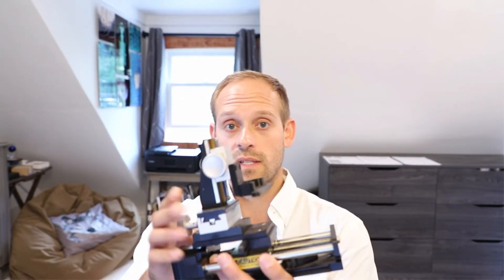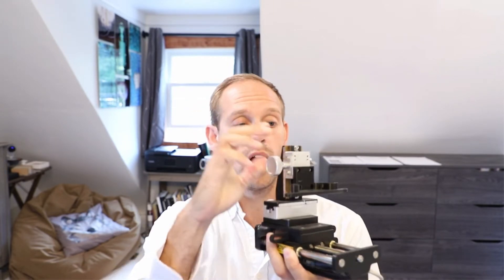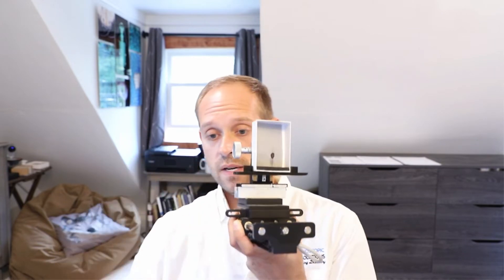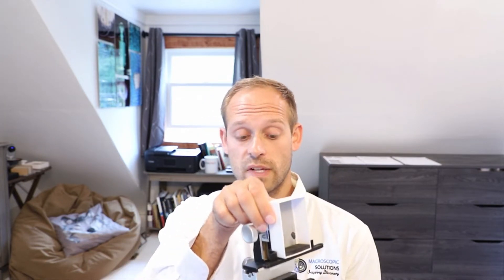A common stage setup allows you to translate your specimen along a Y-axis and along an X-axis relative to the camera. We like to position an insect box on the stage, held tightly with a neutral gray background. This allows us to photograph the specimen in that box very flexibly for focus stacking or 2D imaging. It's a convenient way to mount specimens because you can prepare them in the box prior to placing it on the stage.